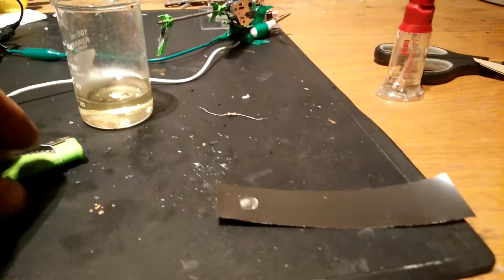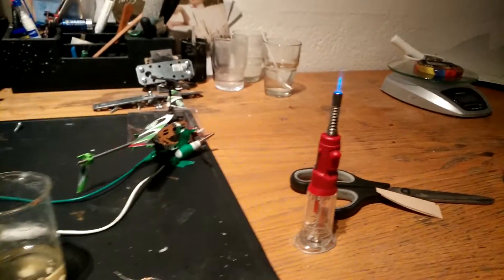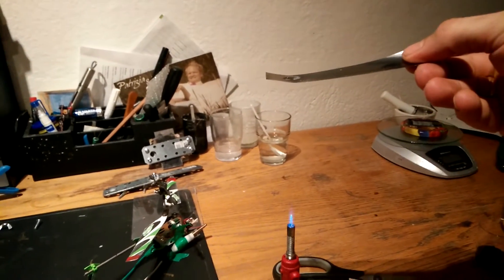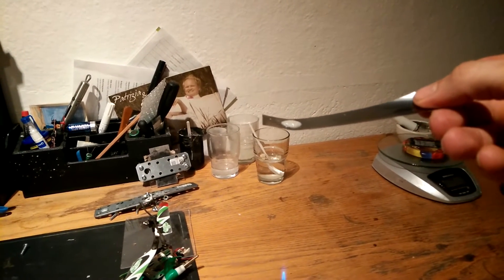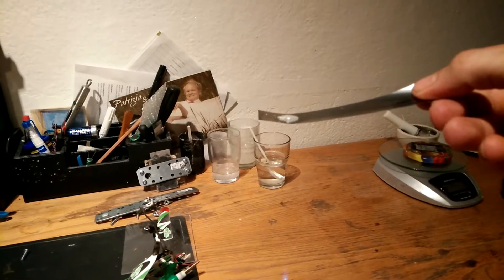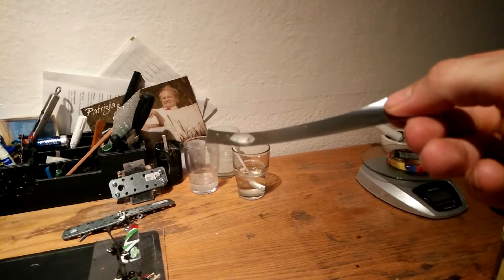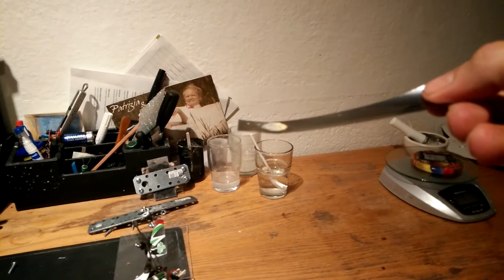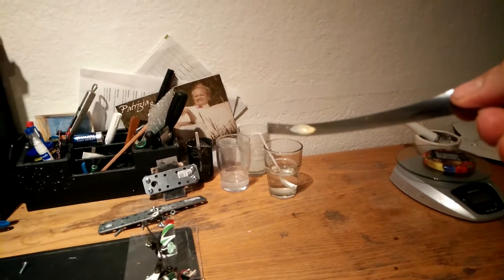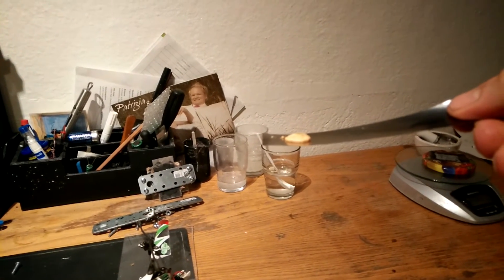You can see just a really small amount of the solution. I think it's important to heat it slowly. It's getting hard.